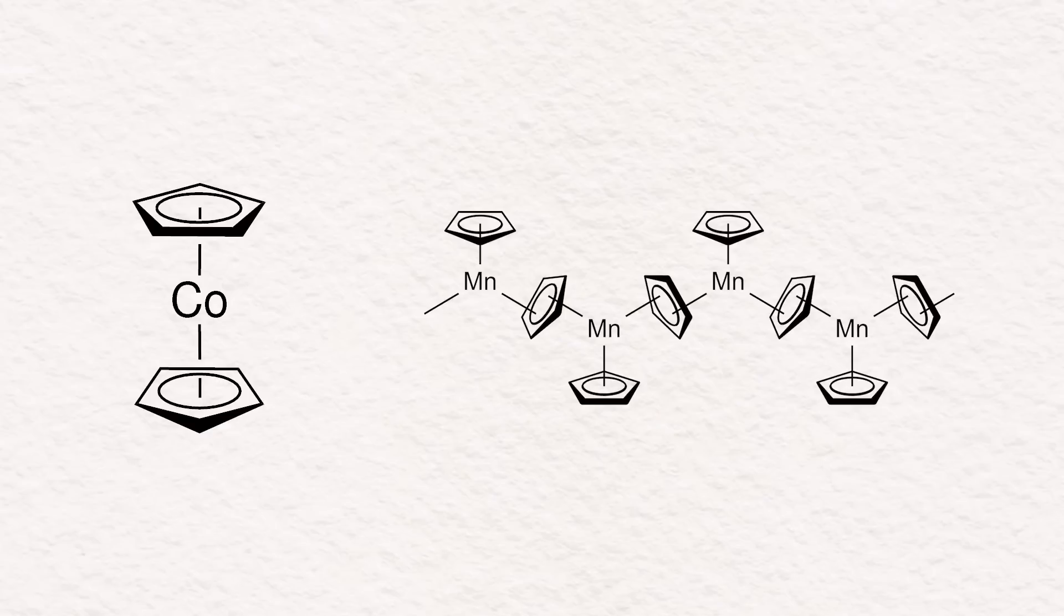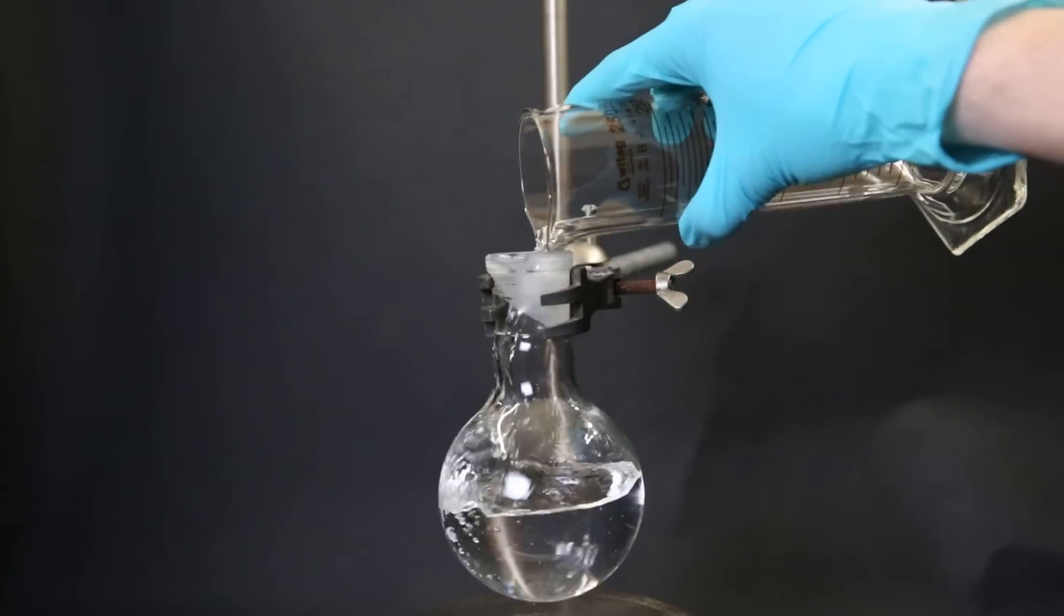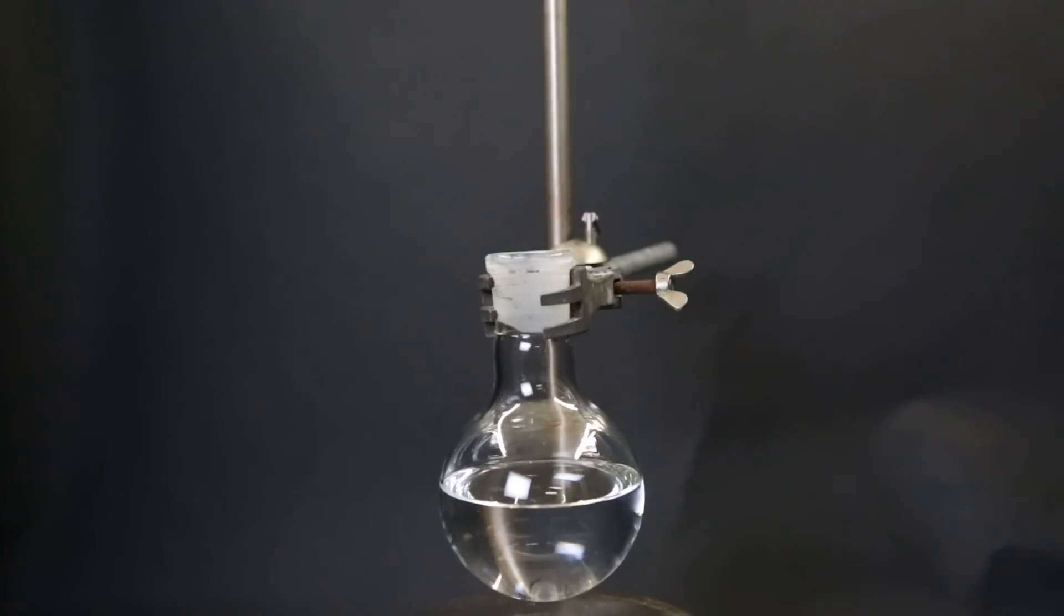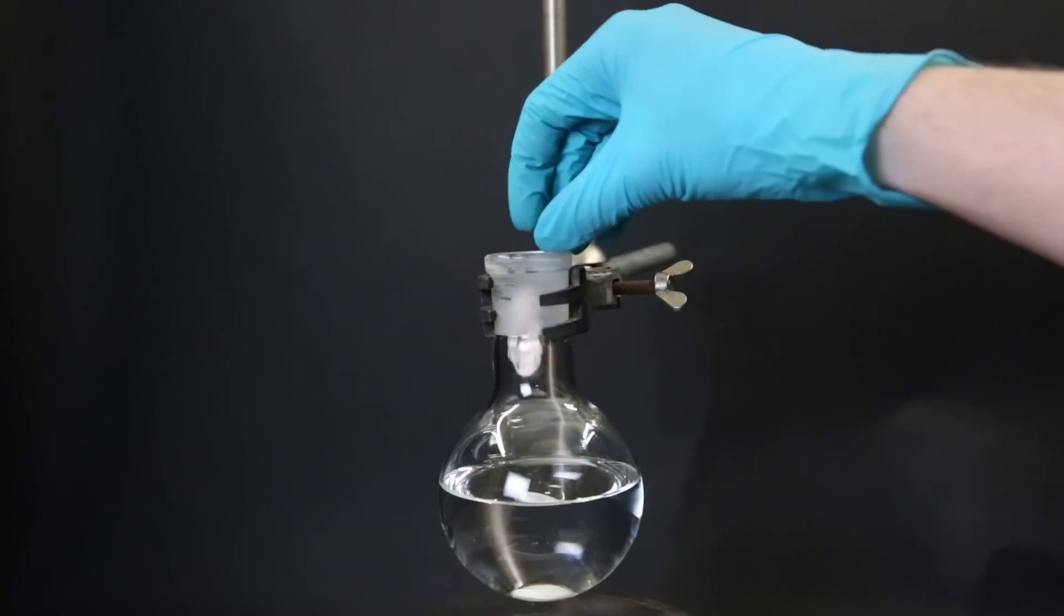The first step is to prepare a solution of the cyclopentadienide ion again, but this time in its sodium salt form. To do that, I fill up a flask with 155 mls of THF. I drop in a stir bar and then add in 8.6 grams of sodium metal that I made in a previous video.